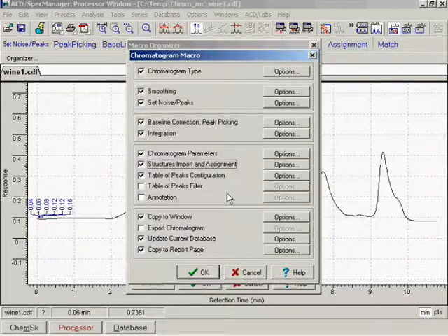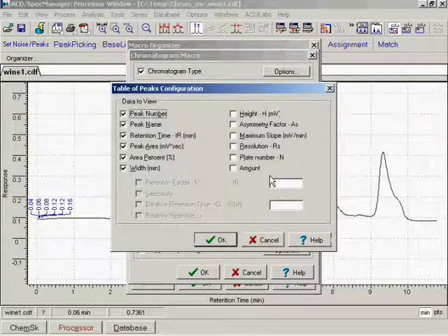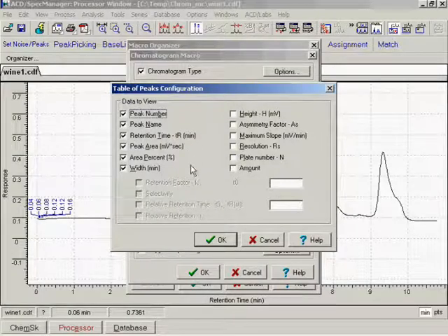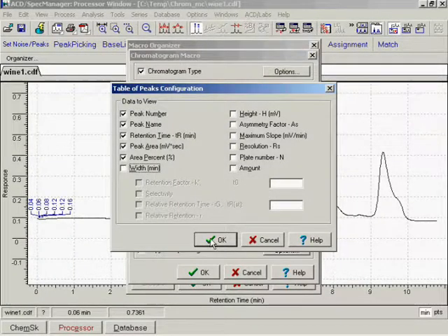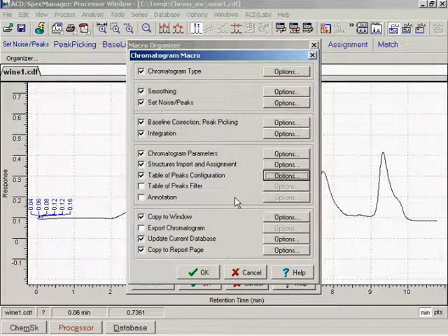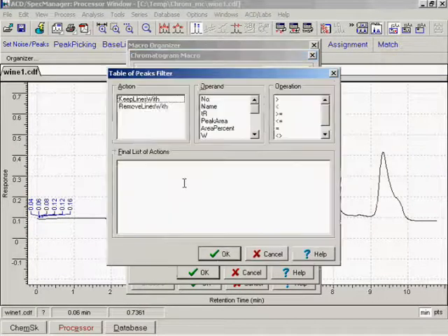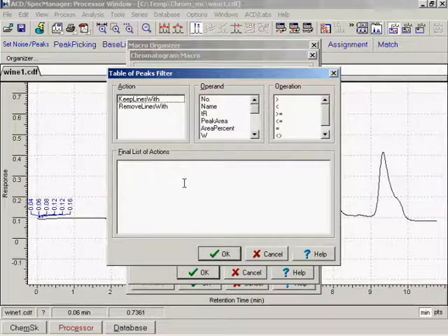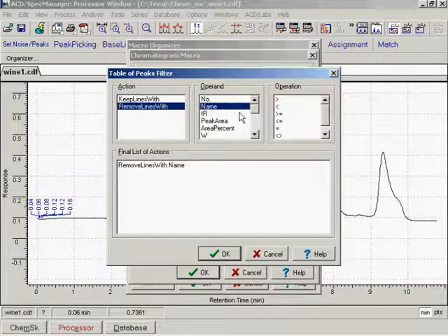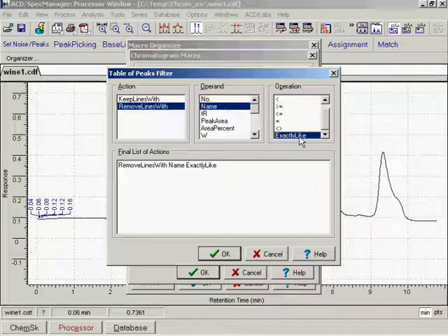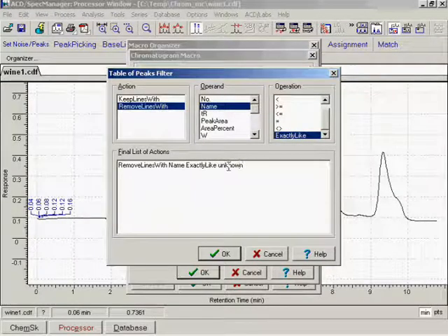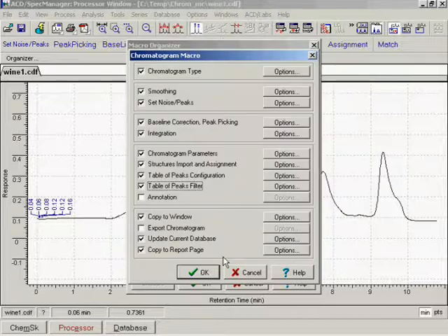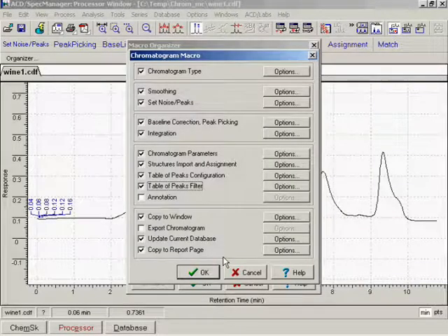Make settings for the table of peaks configuration. Filter the peak table to remove unnecessary information. Annotation will be attached.